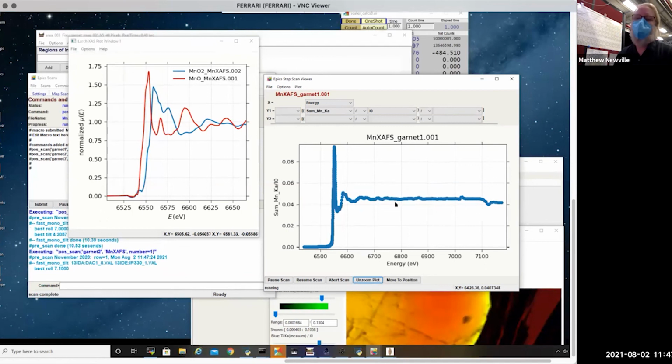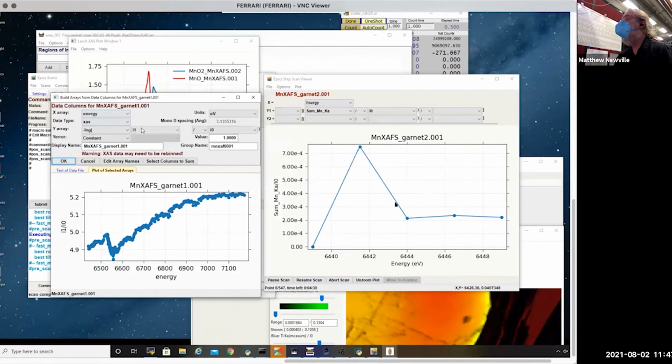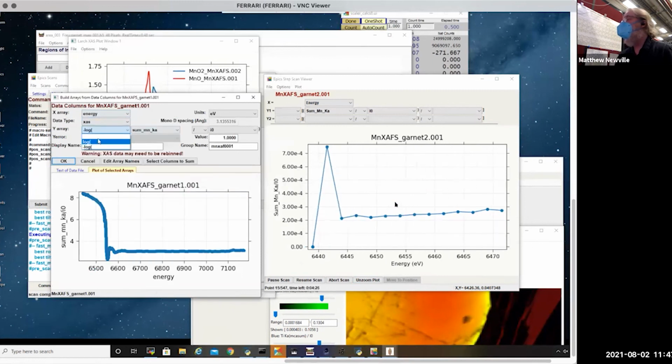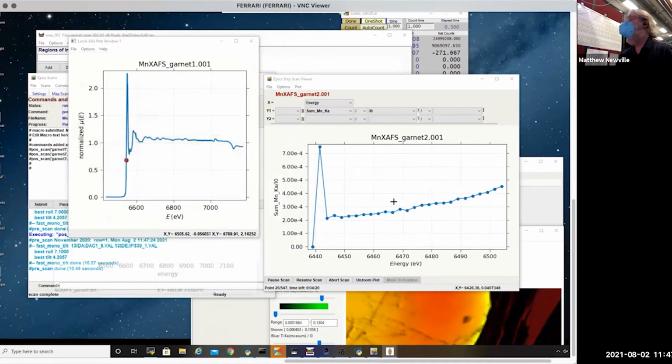That's the iron edge. A ton of iron in the sample, and we get the iron edge. So if I read that one in, I can show you how I'm reading that in. I'm reading that in as the sum of the alpha and not taking the log. And we see that there's the iron edge. And so when I do that, we get this picture.